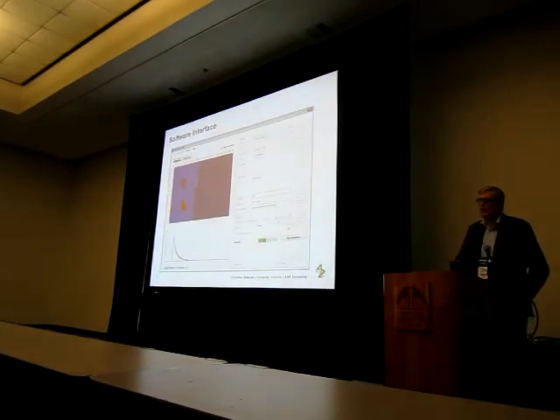I've got to say, it's kind of tough to spot the unusual wells if you just look at that. Maybe if I'd had a little more training, a little more time, I might have been able to do that. But you can see that changing. If you get something that's obviously got a very long lifetime or a really high level of endogenous fluorescence, you can see that changing in that portion of the graphic.